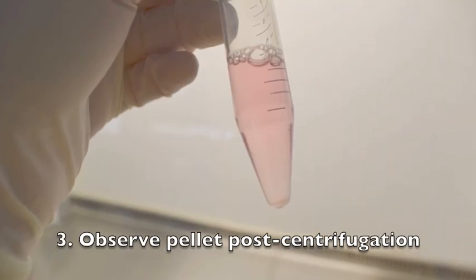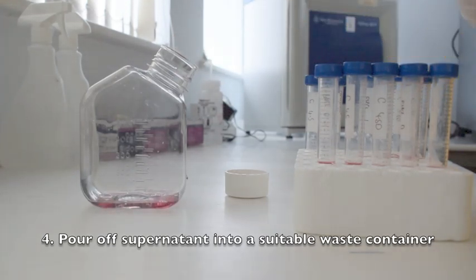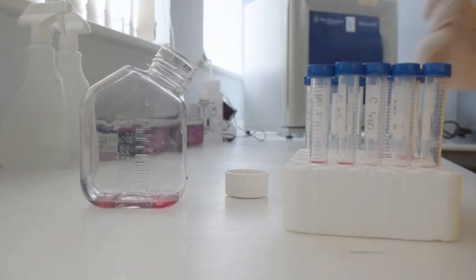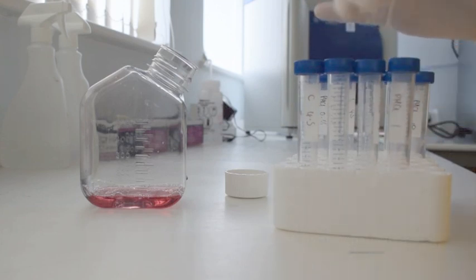Following centrifugation, a cell pellet can be observed. The supernatant is then discarded by pouring. The cell pellet is then resuspended via agitation of the base of the centrifuge tubes.